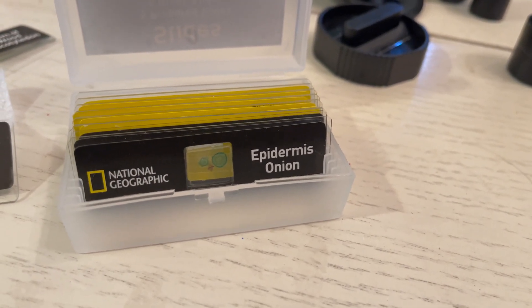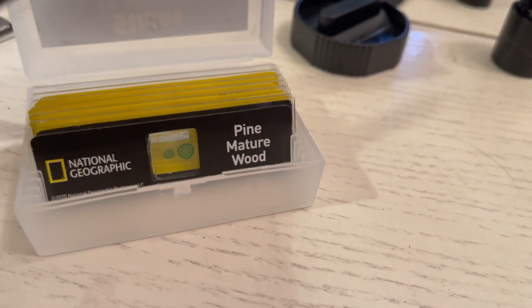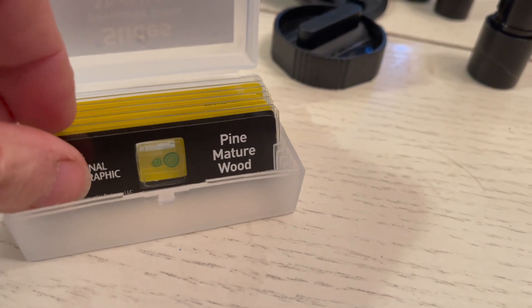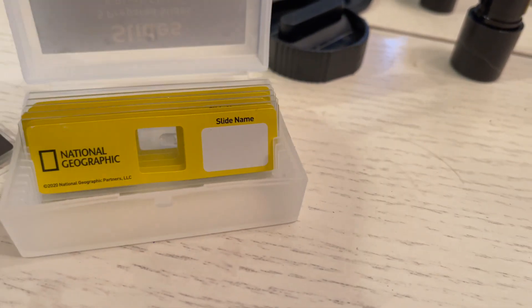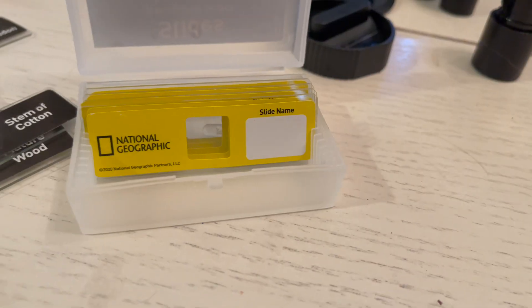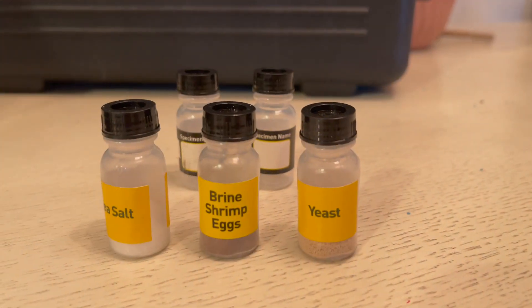The National Geographic microscope includes several pre-made slides so that you can familiarize yourself with the microscope, and it's actually a lot of fun to look at these. We really spent a lot of time looking at the leg of a housefly and it's just so completely different from what you would expect — really interesting.